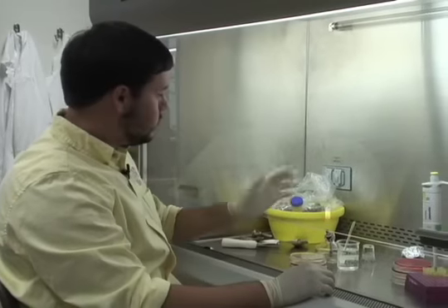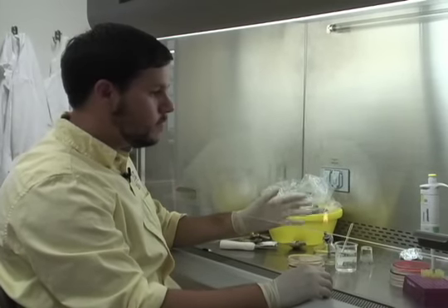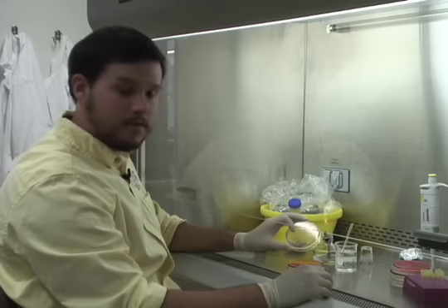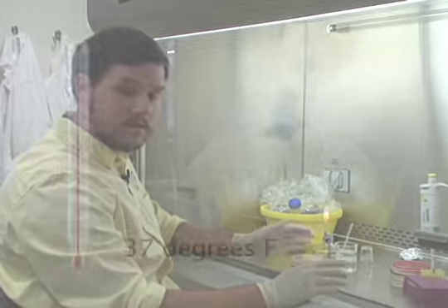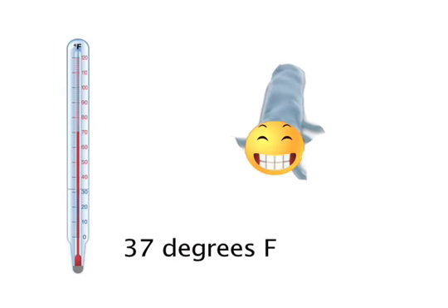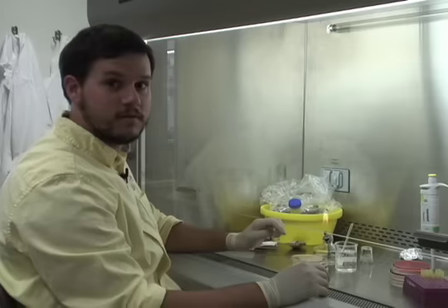Once that's done, set them off to the side to dry. Now that we've blended up the oysters, recovered the bacteria, and plated them out on media to grow, we're going to put them at 37 degrees, their preferred temperature, so they're nice and happy. Let them grow up overnight and hopefully tomorrow we'll see nice individual colonies.